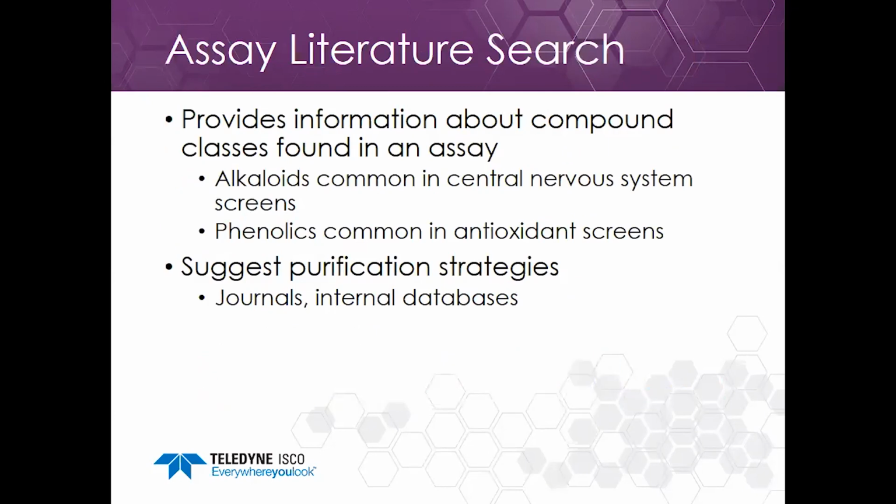Also, look at the literature for the assay that you propose to run. If you're running hypothetically a PLA2 assay, look that up in the scientific literature. Alkaloids are very common in central nervous system screens, and I find phenolics are common in antioxidants as an example.